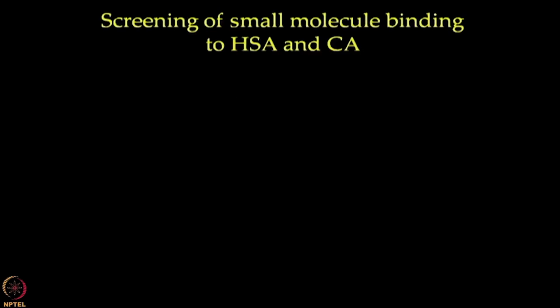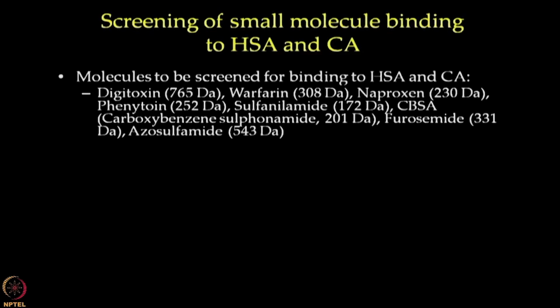These small molecules to be screened for binding will include digitoxin, warfarin, naproxen, phenytoin, sulfanylamide, carboxybenzene sulfonamide, furosemide and azosulfamide.